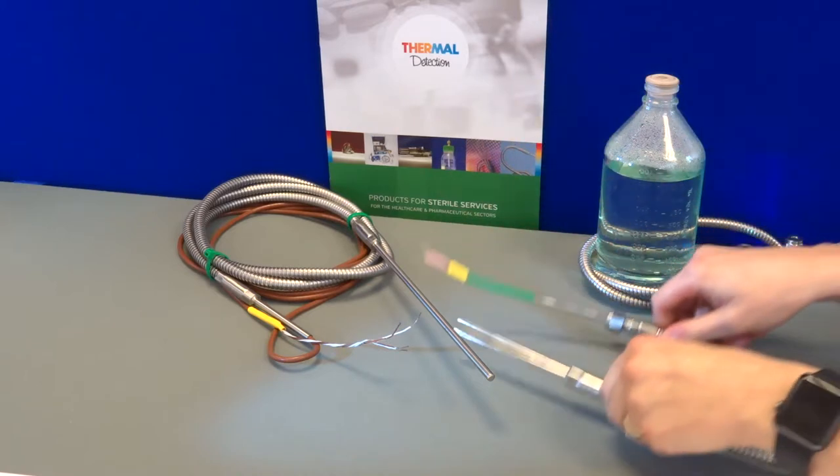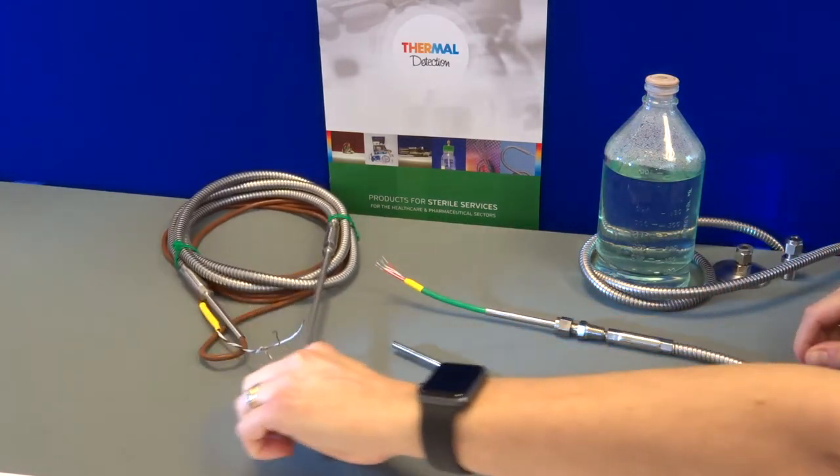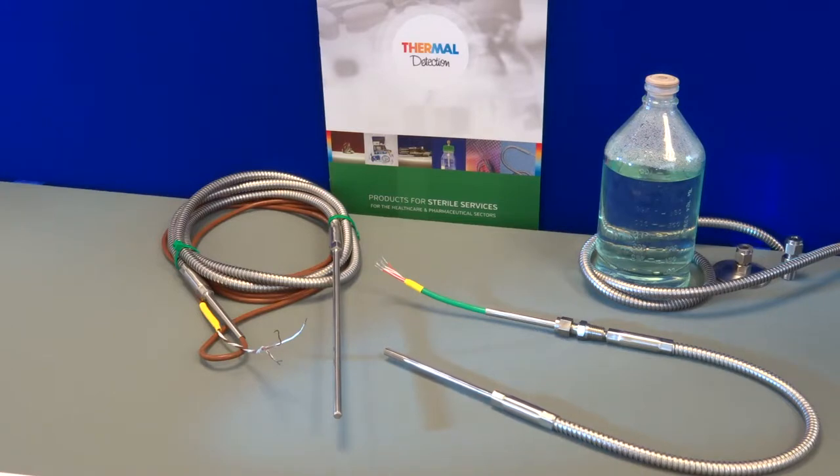The Steriprobe has been designed to measure the temperature inside of an autoclave without the loss of pressure or vacuum. The Steriprobe has a rugged construction which is suited to the arduous conditions found in today's modern autoclaves.